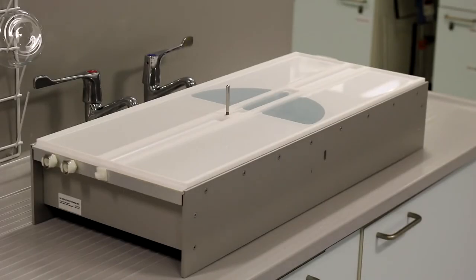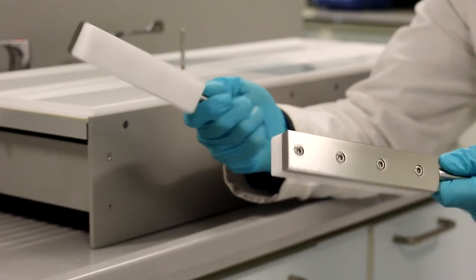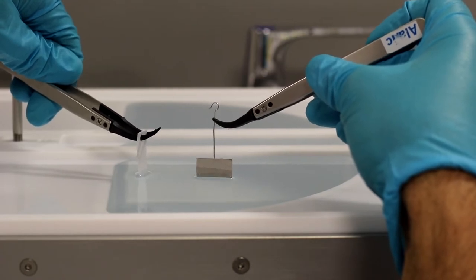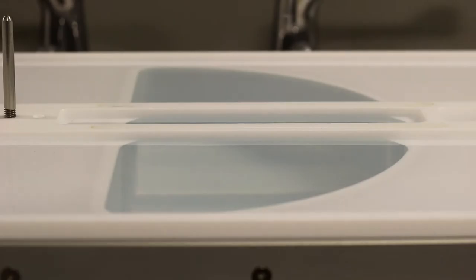We will need to clean the trough, which holds the water, the barriers, which compress the floating monolayer, the Wilhelmi plate, which measures the surface pressure of particles or molecules at the air-water interface, and the water's surface.